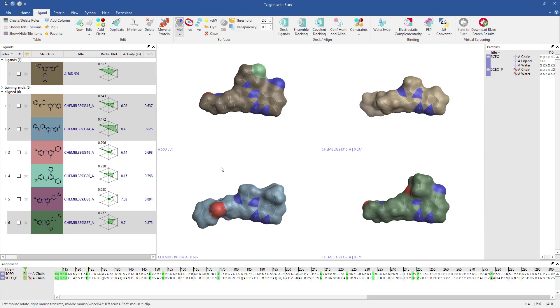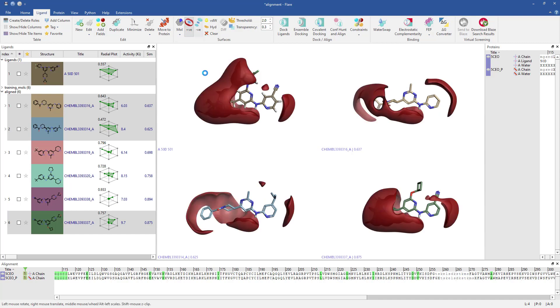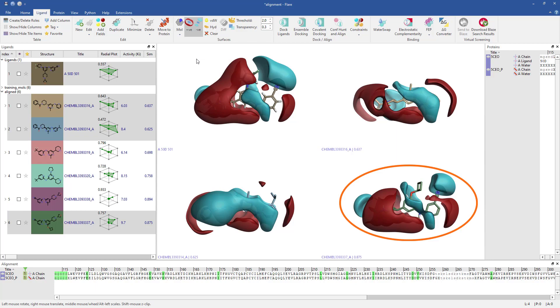I can also compare the electrostatic fields for each ligand by turning off the molecular surfaces and activating the positive and negative electrostatic field buttons. Areas where the electrostatic field is positive are colored red, while negative is colored blue. It is clear that the electrostatic fields for the most active DLK ligand are most similar to the reference molecule.